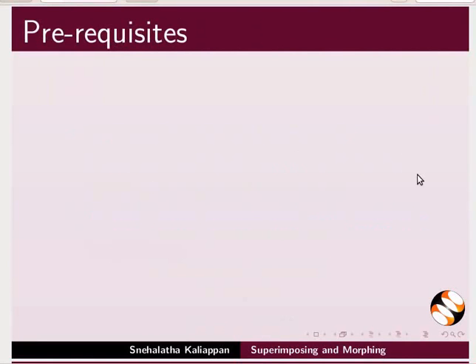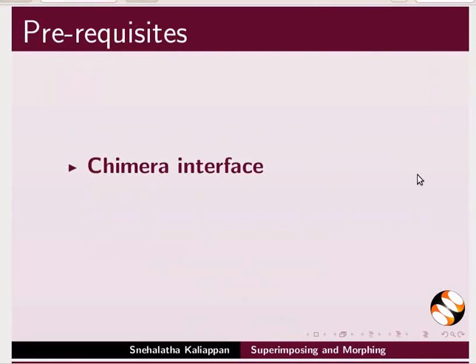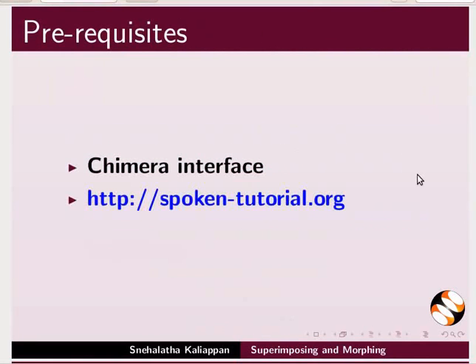To follow this tutorial, you should be familiar with Chimera interface. If not, for previous tutorials, please visit our website.